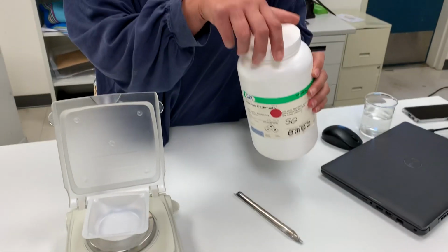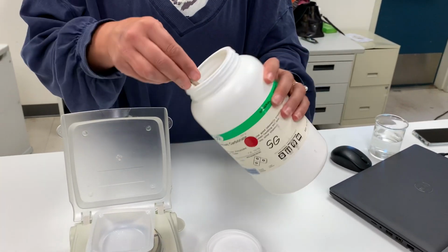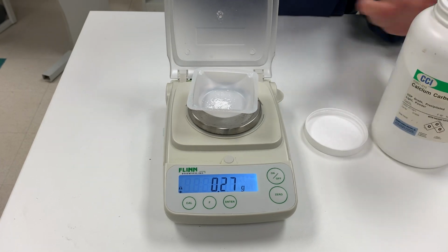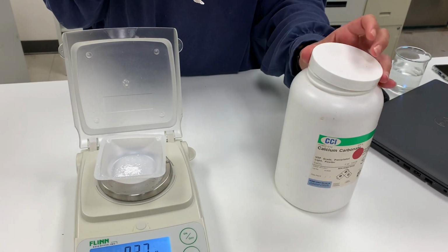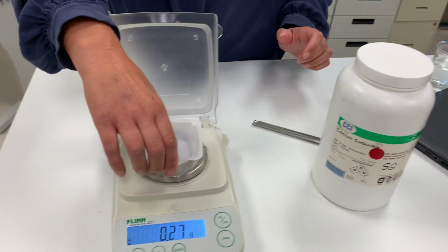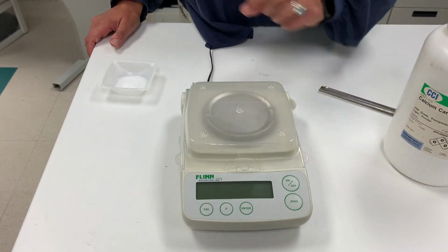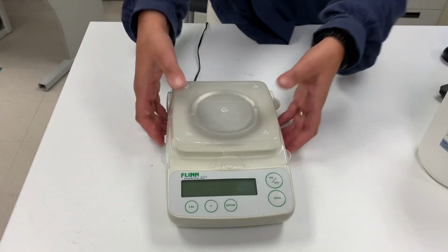You take the lid off once you're ready to weigh and use something called a scoopula to scoop out the chemical. You put whatever weight you need on there and you record it, and then you return the lid back to the reagent bottle right afterwards after recording your mass. You then carefully remove your reagent with weighing pan and you turn off and close the balance. So all very careful, slow and steady wins the race.